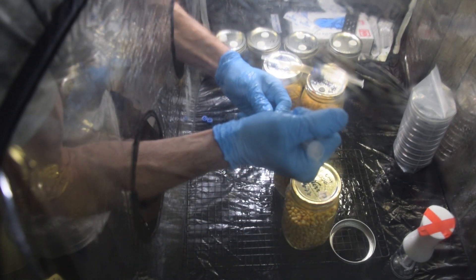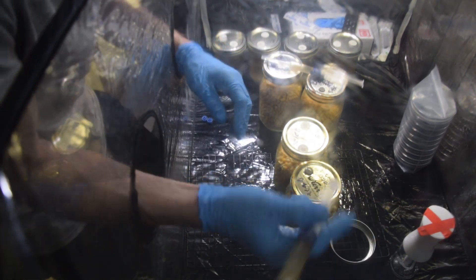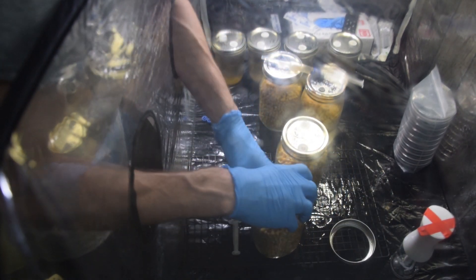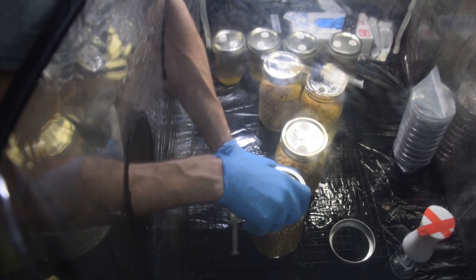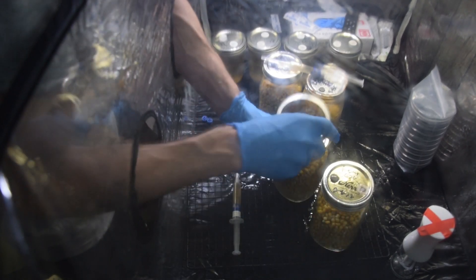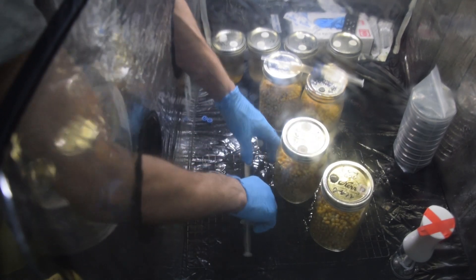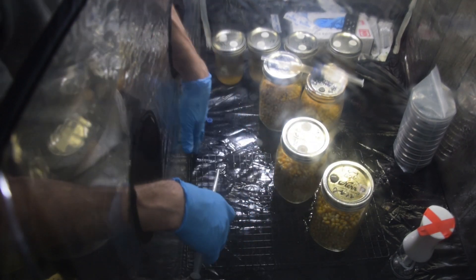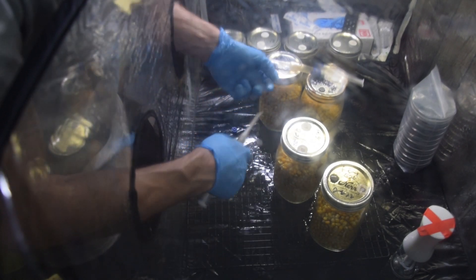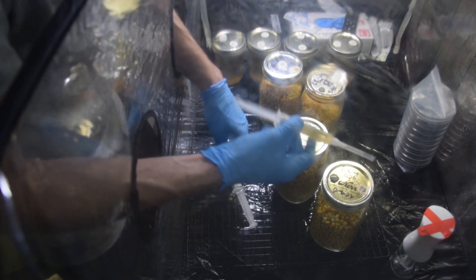...and if you have a strong liquid culture — and these are pretty strong, see how thick these are — two cc's is going to colonize really quickly and the risk of wet rot is pretty low. You can probably even go higher than that, as long as it's a really vigorous liquid culture and your grain spawn is very dry. If you already have a wet grain spawn, you're kind of shooting yourself in the foot.